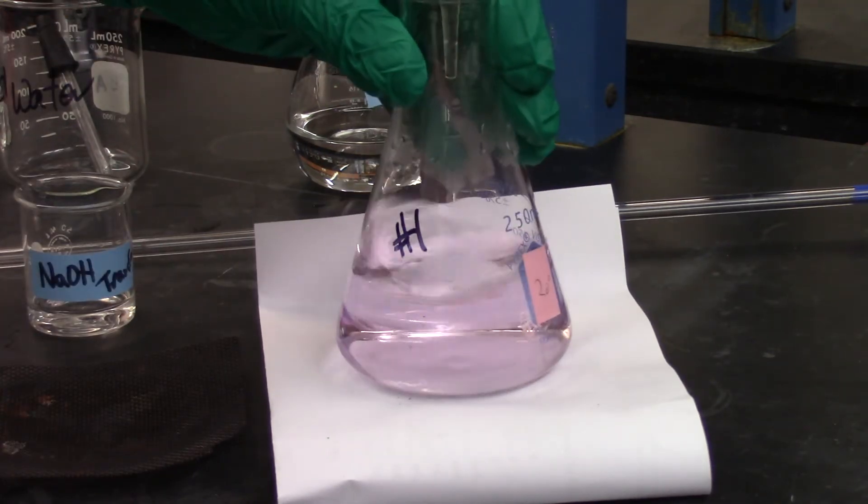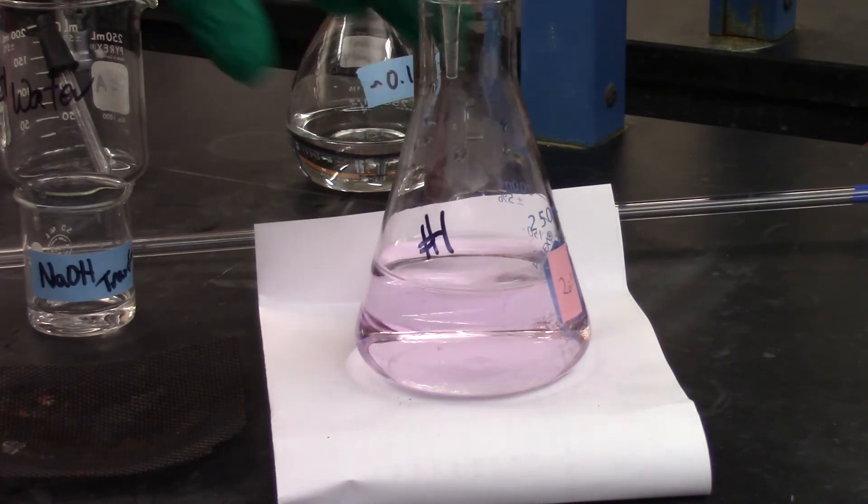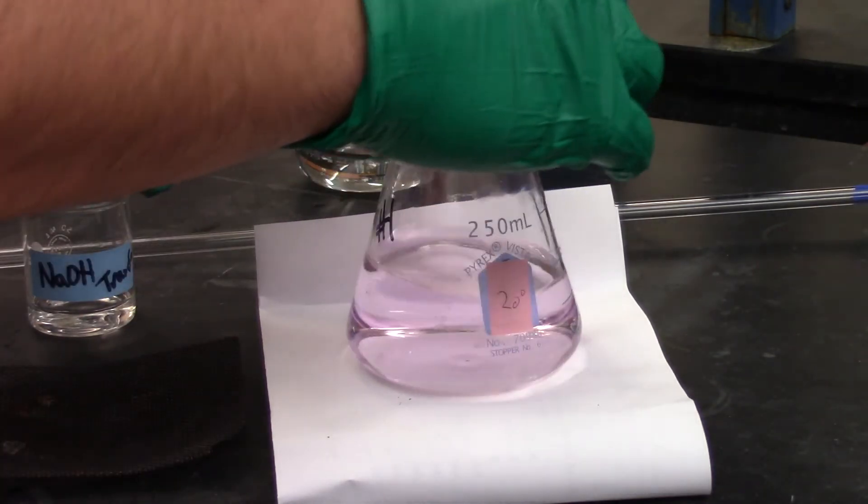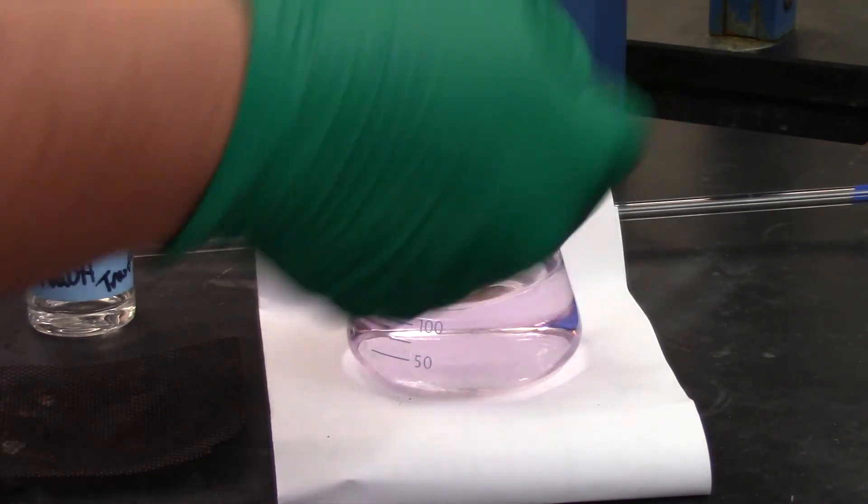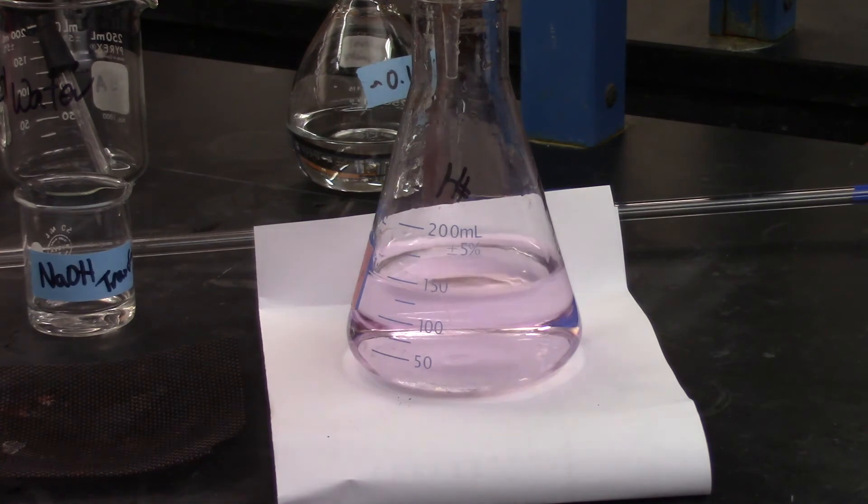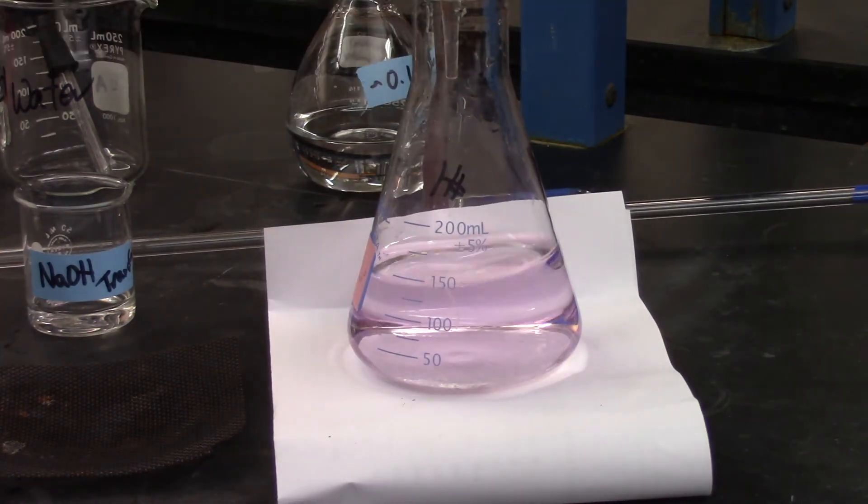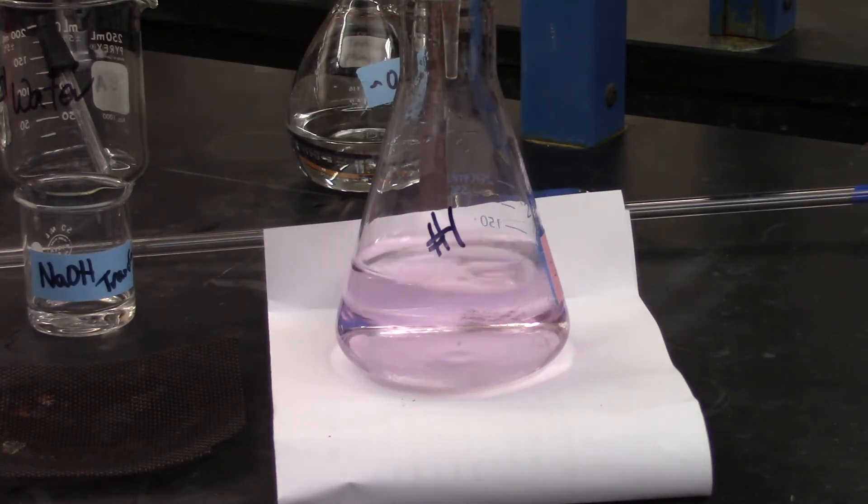So as you can see, I have my pink color. And that is going to be the appropriate color you want for your titration. I'm going to rinse down the sides here. So any unreacted KHP will fall down and actually react and can make that color a bit lighter. Awesome. So that's titration one, and I'm going to record that volume.